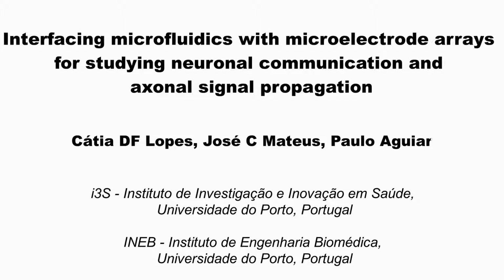The overall goal of this protocol is to demonstrate how to combine the use of microfluidics with microelectrode arrays to generate a platform suitable for studying neuronal communication and axonal signal propagation.